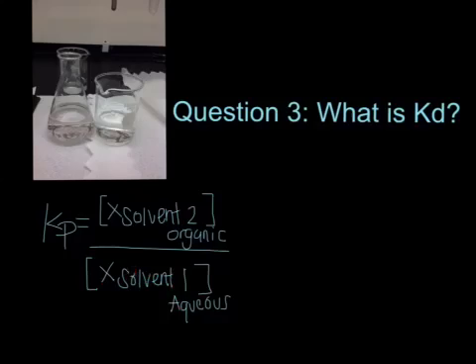So this indicates that multiple extraction will have a better Kp. The Kp is calculated by calculating the amount of extraction of solute depending on the amount of volume needed for the solvent. So on that ratio, that will give you the Kp.